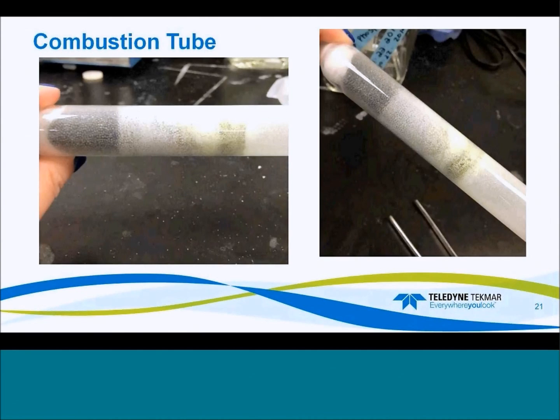You just have to be very careful that you don't cut yourself on the quartz combustion tube because it is breakable and you can get hurt with it.